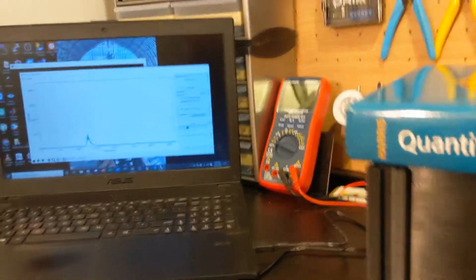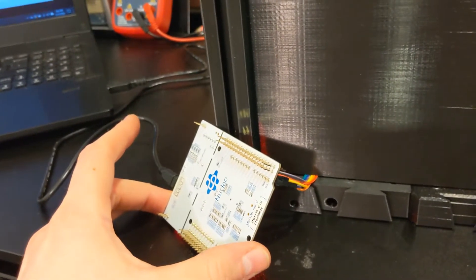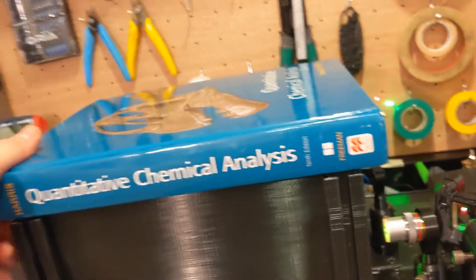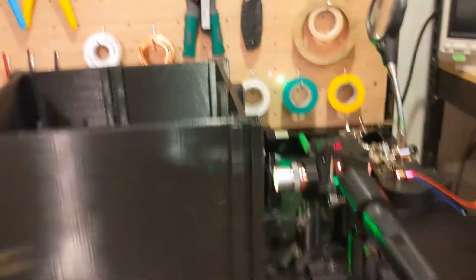There are all the walls. This is the STM32 microcontroller, hooked up to my computer, and that's how the computer is receiving the data that the CCD is outputting. I did not 3D print a roof for this yet — that's why I have this book on there.